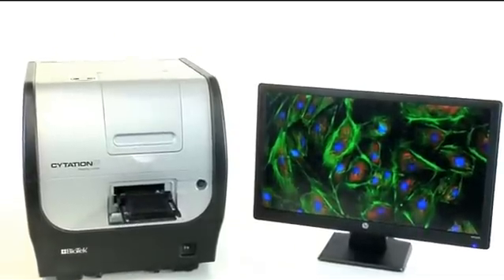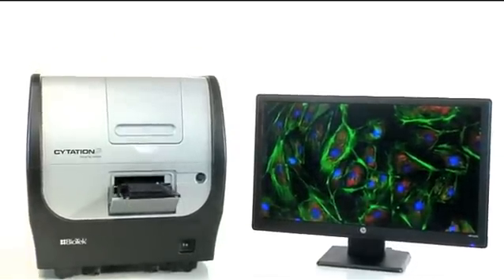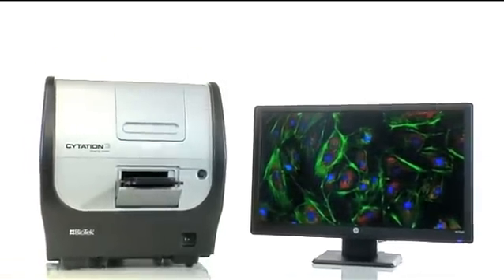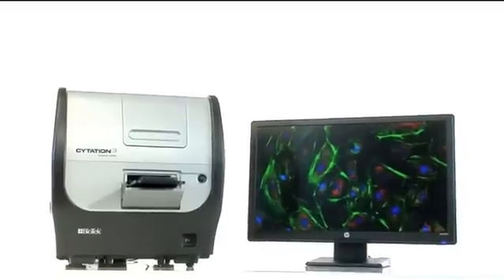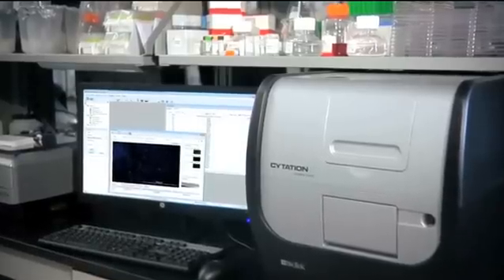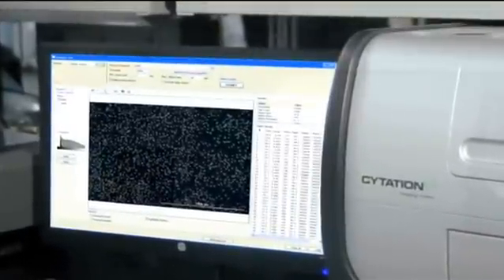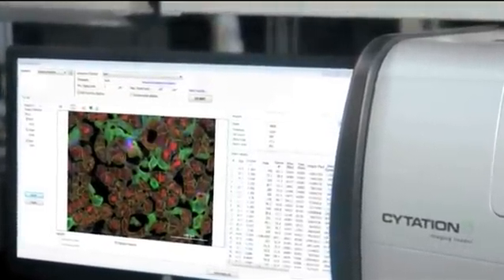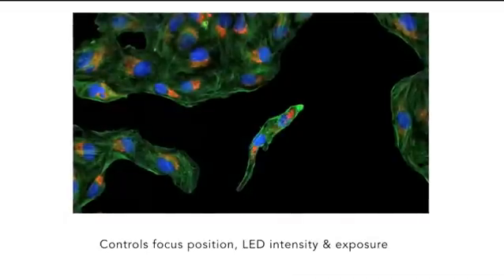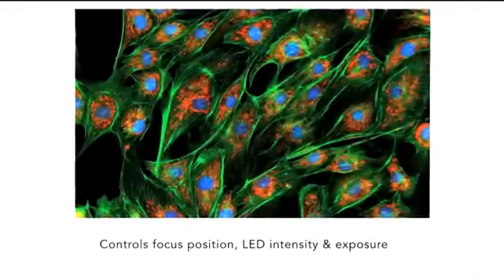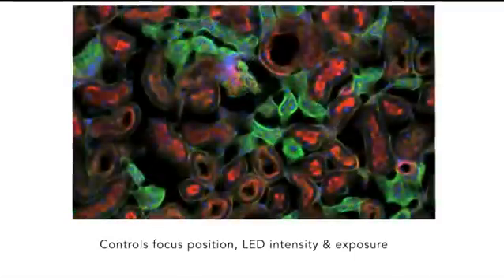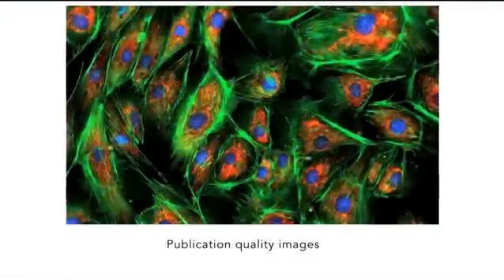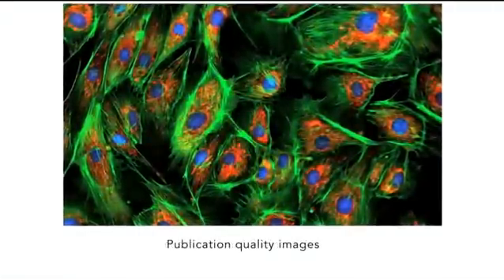User-replaceable objectives are available in 2, 4, 10, and 20X magnification to cover a wide range of cell imaging applications, from cell counting or cell migration assays to analysis of intracellular details. The system automatically controls the focus position, LED intensity, and CCD camera exposure parameters, and provides the highest quality images, captured effortlessly.